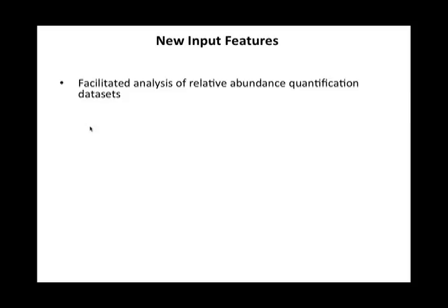Some of the new organisms that were added: we were already allowing the analysis of human, rat, and mouse with PSEA-Quant, and now we have added Drosophila melanogaster, or fly, and yeast, Saccharomyces cerevisiae, based on user feedback. So we constantly listen. We have a good pool of users, and they do not hesitate to ask if the analysis can be performed on a certain organism. And so we've been adding these in order to cater to their needs.